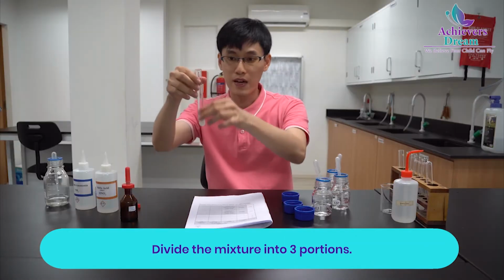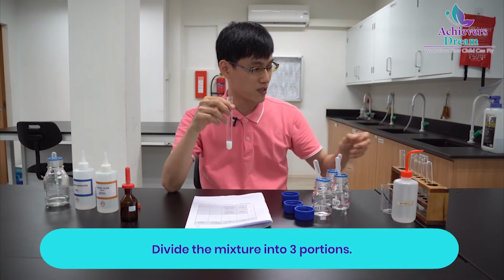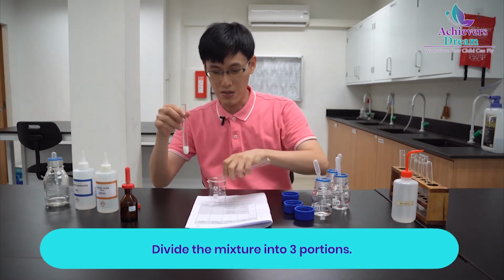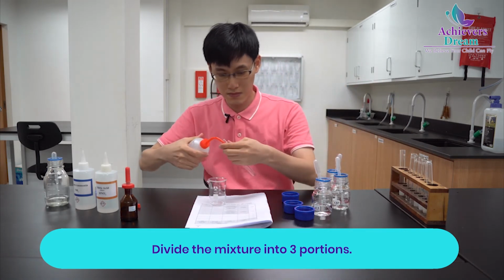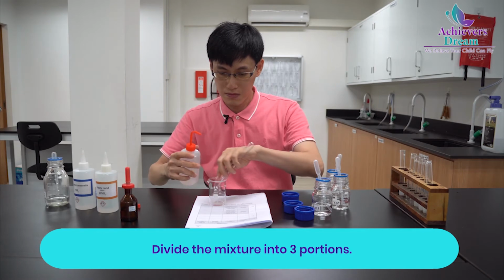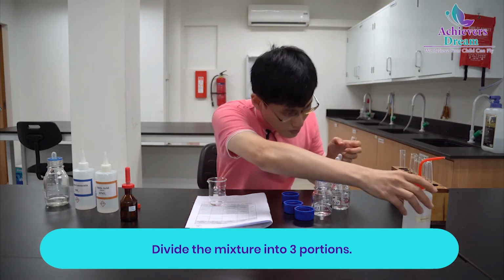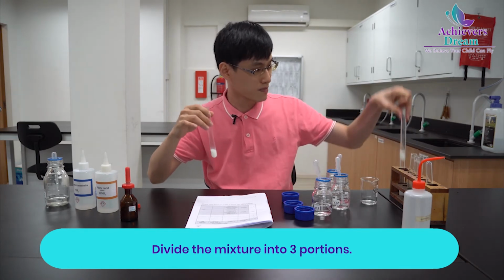So I'm going to divide the solution into 3 portions. Oh, not enough test tubes. Let me just do a quick rinse. Okay. So 3 portions.